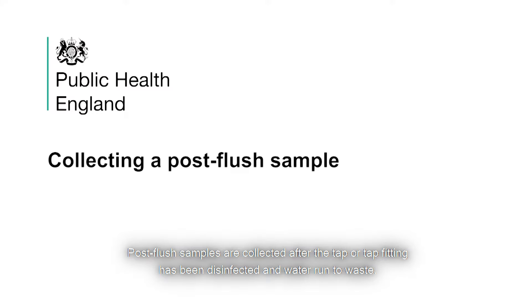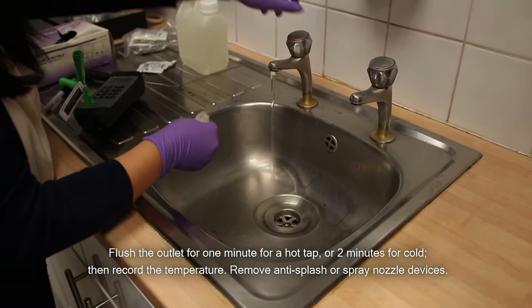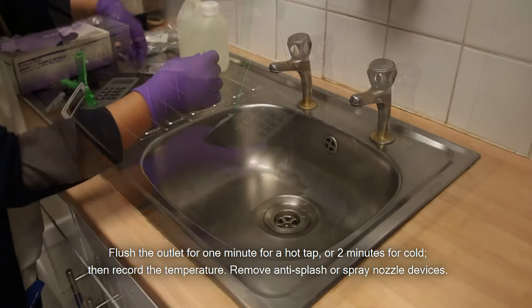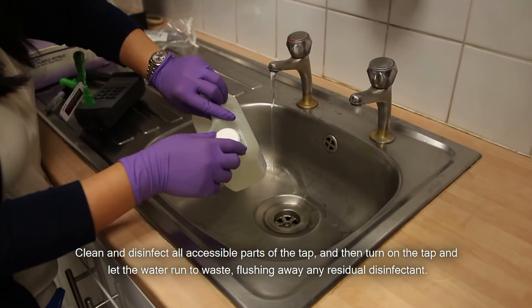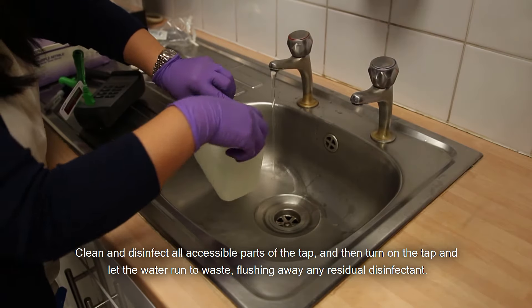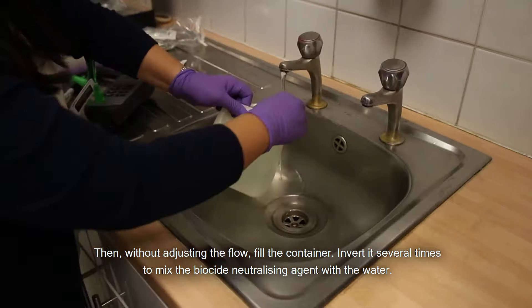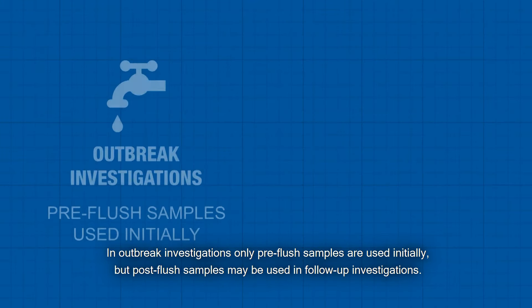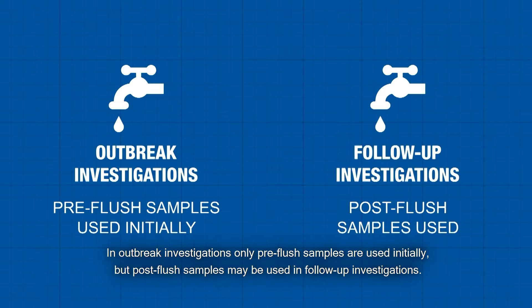Post-flush samples are collected after the tap or tap fitting has been disinfected and water run to waste. Flush the outlet for 1 minute for a hot tap or 2 minutes for cold and then record the temperature. Remove anti-splash or spray nozzle devices. Clean and disinfect all accessible parts of the tap, then turn on the tap and let the water run to waste, flushing away any residual disinfectant. Then, without adjusting the flow, fill the container. Invert it several times to mix the biocide neutralising agent with the water. In outbreak investigations, only pre-flush samples are used initially, but post-flush samples may be used in follow-up investigations.